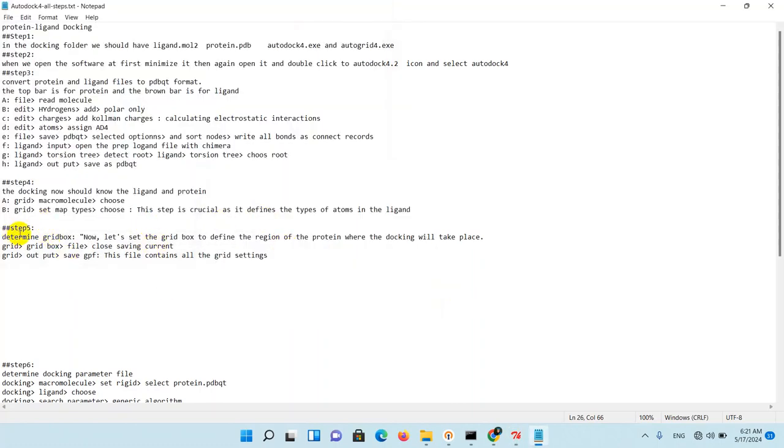In the next step, step five, you need to determine the grid box. Now let's set the grid box to define the region of the protein where the docking will take place. So go to Grid, Grid Box, and then close saving current.